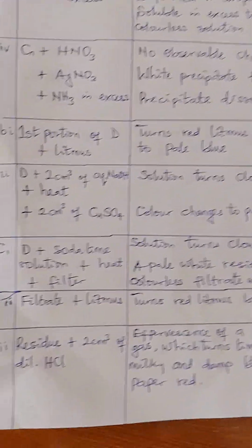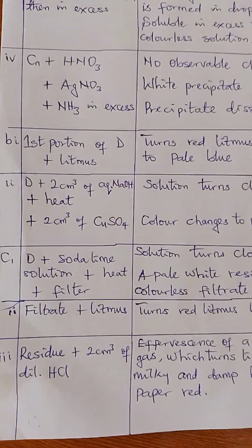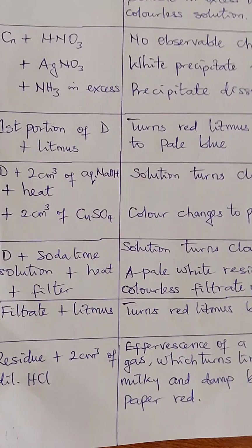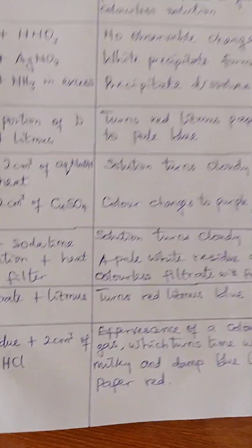Now, sample plus soda lime solution plus heat, and you can test with filter paper depending on what the question says. We are just projecting the question.